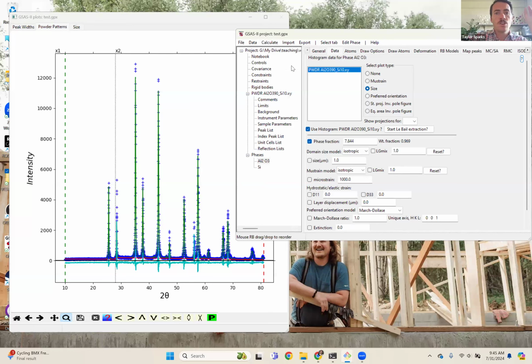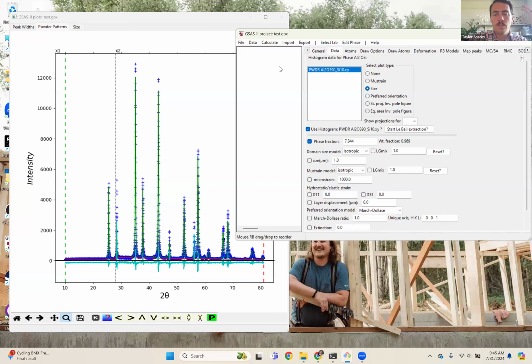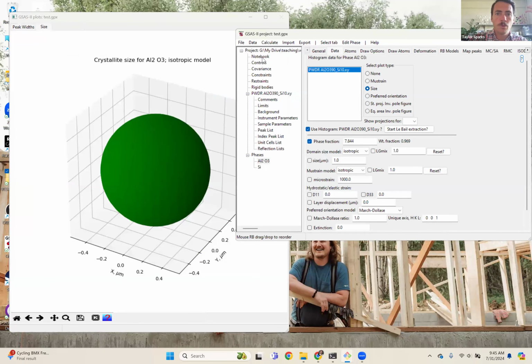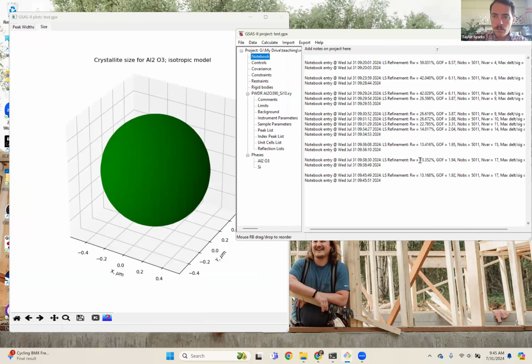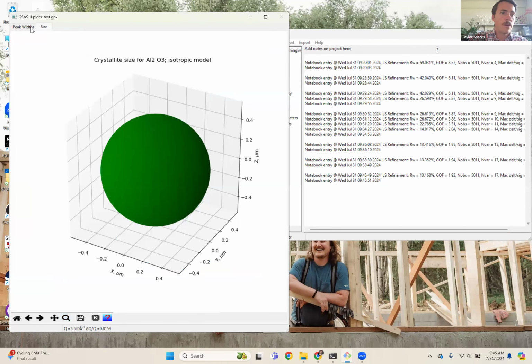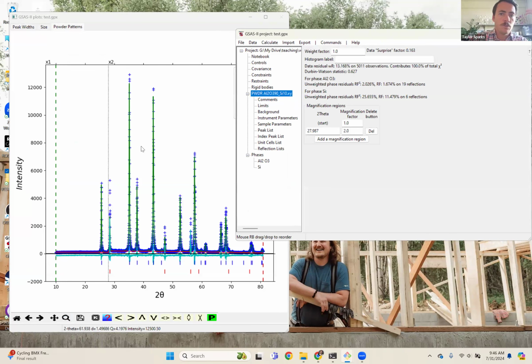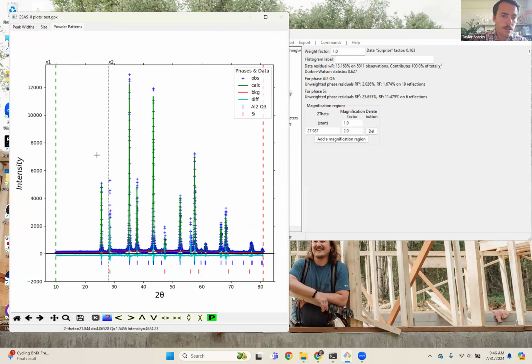That's going to change the sharpness of the peaks for the two different phases independently. And it looks like it improved it a little bit. It went down from 13 and a half or so to 13.1 maybe. A slight improvement. I'm curious what it actually did to the diffraction pattern. Notice again that the powder pattern here has disappeared. To make it come back, I'm going to click this powder one in the tree. And let's zoom in on those first two, which have been causing the problems.